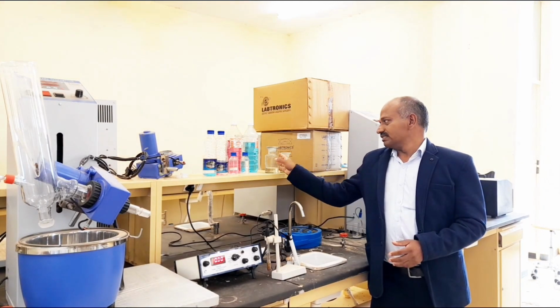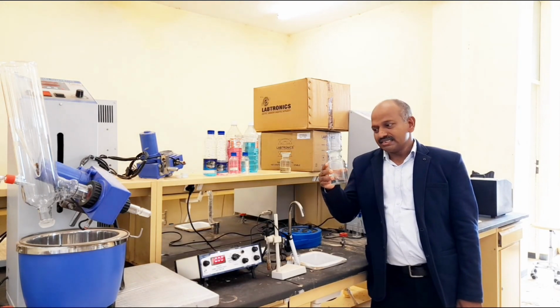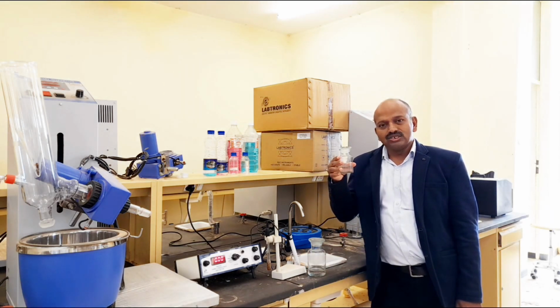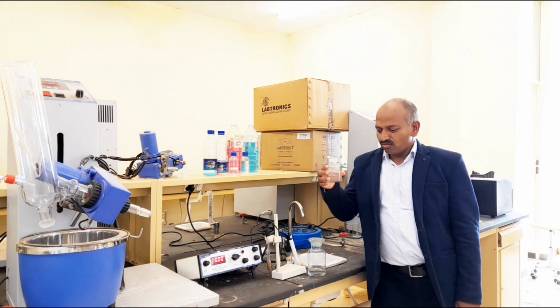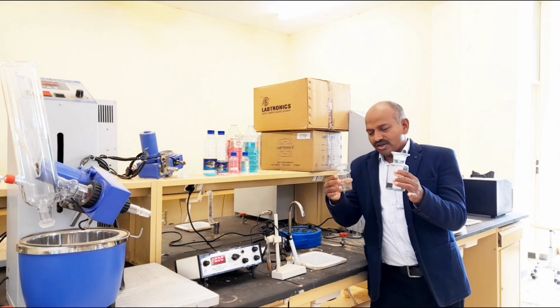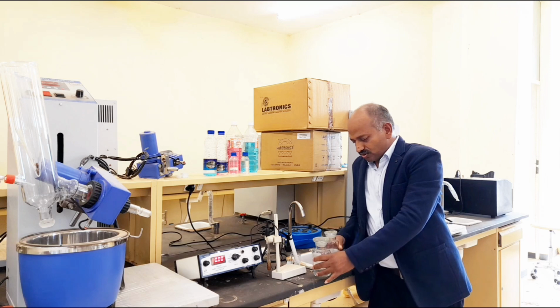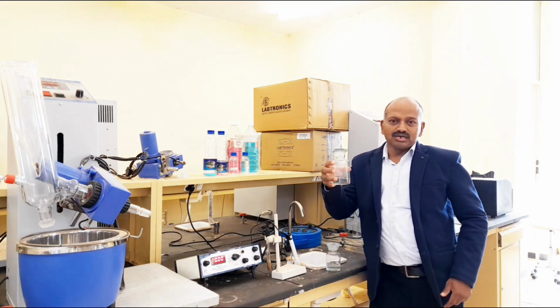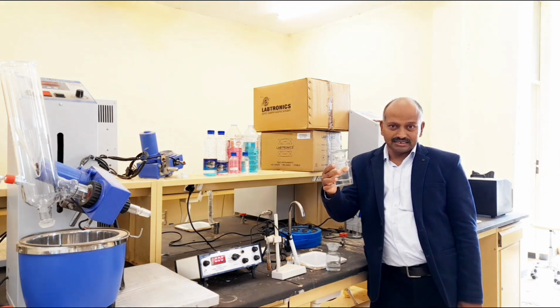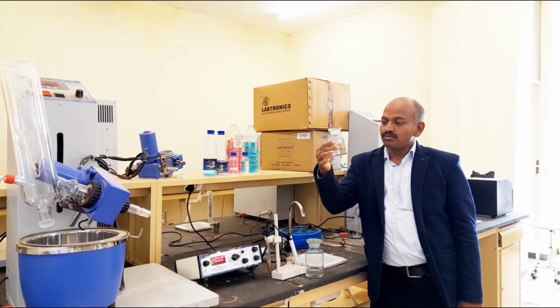So this is the hydrochloric acid, which is already standardized using the standard solution of sodium carbonate, and the strength is already identified. And this is the sodium chloride and sodium hydroxide mixture. These two reagents are colorless solutions, so we have to identify which is the acid and which is the mixture. The bigger reagent bottle is the acid solution of known concentration, hydrochloric acid, and the smaller reagent is the mixture containing sodium chloride and sodium hydroxide.